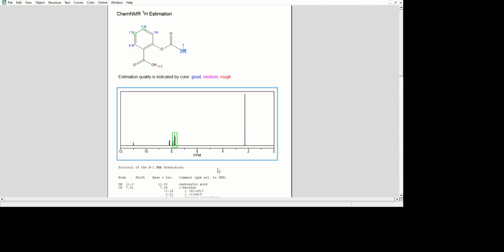We calculate it by comparing it with TMS, that is tetramethylsilane. If you want to know about TMS, I can write here. When you watch my video, please do keep one notebook. TMS, fine. If you want to know about TMS, write in the comment box. Otherwise, it's not possible to discuss each and every point through the video.